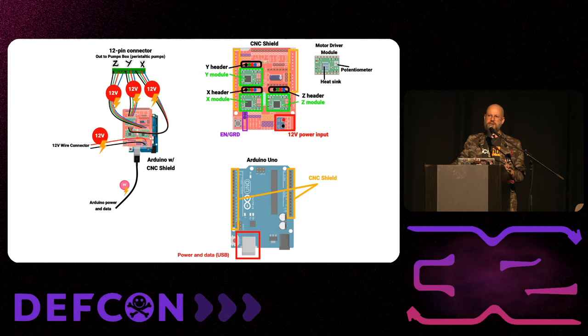And one of the things that's important about this is that when you're doing chemistry, most steps in most procedures for doing synthesis say, add this amount of this thing this quickly or slowly, then bring it to this temperature and stir it for this long. And so one of the things that it allows us to do, with a recent update that's really great, is you can say, add this over this amount of time. And this allows for a lot more things to be done.